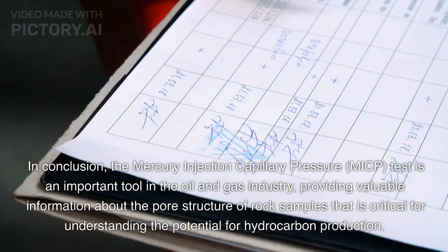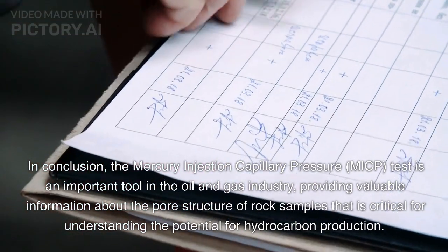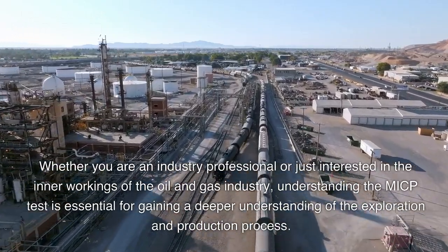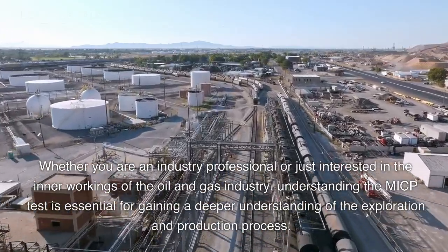In conclusion, the Mercury Injection Capillary Pressure (MICP) test is an important tool in the oil and gas industry, providing valuable information about the pore structure of rock samples that is critical for understanding the potential for hydrocarbon production. Whether you are an industry professional or just interested in the inner workings of the oil and gas industry, understanding the MICP test is essential for gaining a deeper understanding of the exploration and production process.